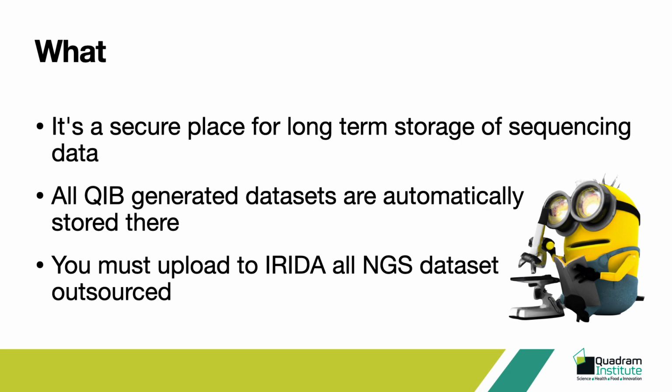All datasets produced by our sequencing core are automatically uploaded in the IRIDA server, and you will get access to the relevant projects. If you outsource the sequencing, you have to upload the reads to IRIDA by yourself or ask core bioinformatics to do it for you. Yes, you can raise a ticket for this.